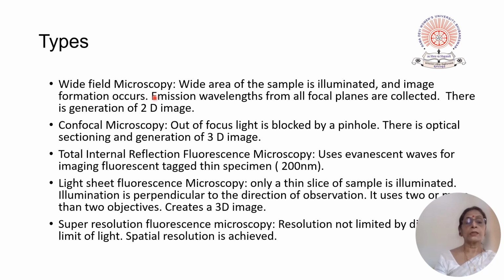It is called as wide field microscopy because wide area of the sample is illuminated and then the image formation occurs. Emission wavelength from different focal planes are collected and there is generation of a two-dimensional image.